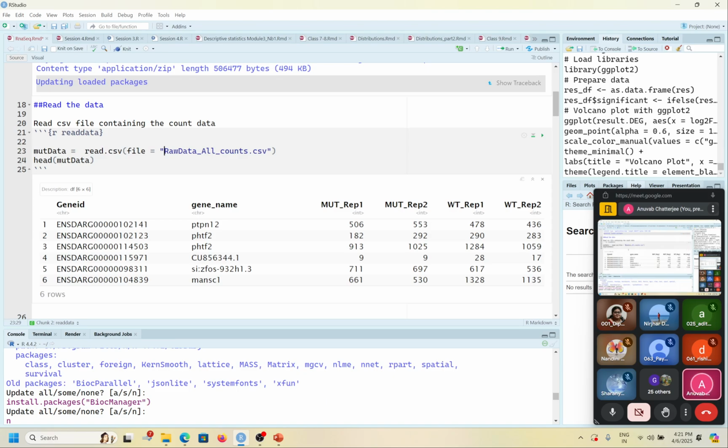Whenever you send your RNA for sequencing, this is the file that you should get. Any company, any research you do, you send for bulk RNA sequencing, they will send over a file such as this. This is a general idea of it. The first column most of the time is the gene ID. These are all IDs of the genes. If you have been doing a bit of bioinformatics, you know these are Ensembl IDs from the EMBL dataset. Essentially this is the general ID for the gene, and then you have the gene name followed by how many transcripts were detected.